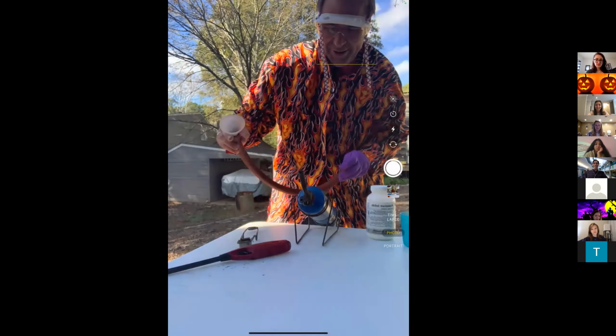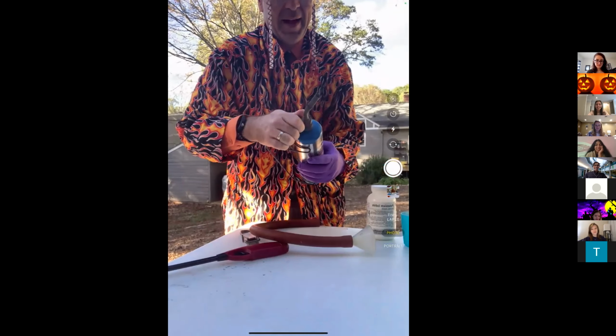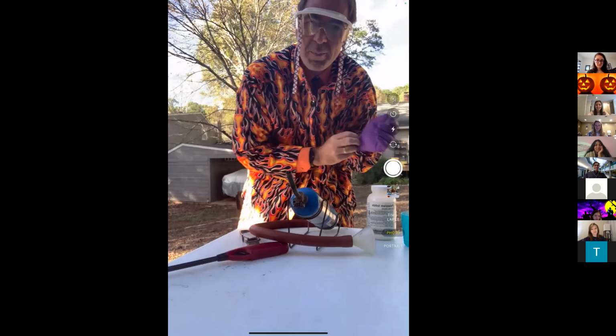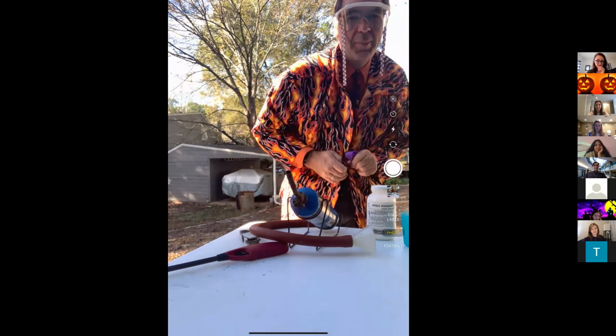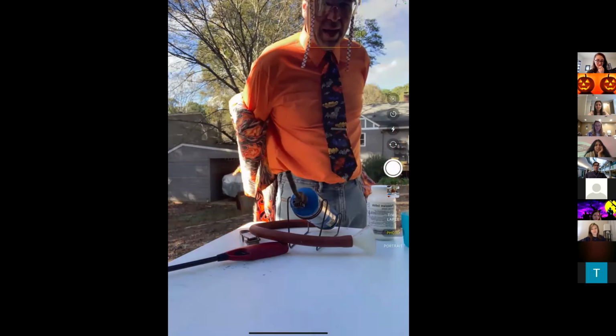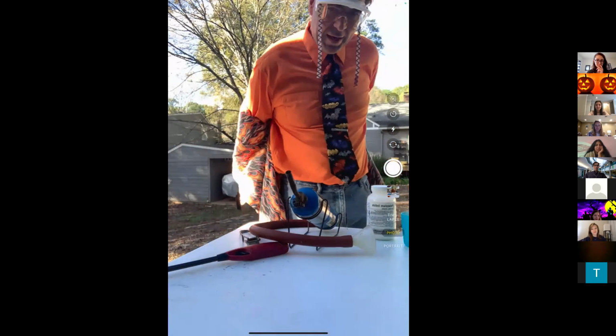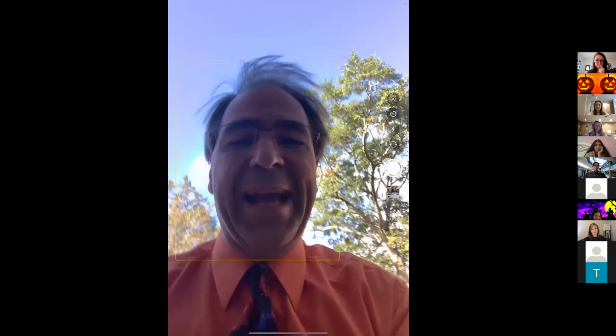Oh, it worked. All right, so nice fireball there. Something that doesn't normally react very quickly, because they can't mix the oxygen and the lycopodium. But when you put it through a funnel, then you get good mixing, and now all of a sudden you get a good reaction there. Okay. Random way to start, but I just can't resist doing a few demos.